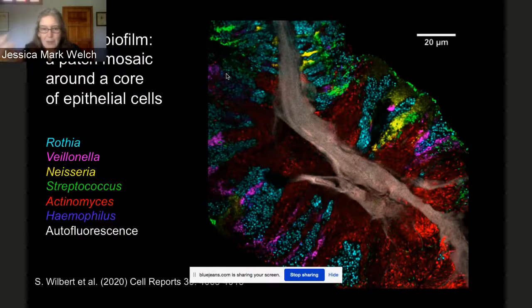I'm like, oh, great, we can take samples, right? So if you clean your tongue the way dentists tell you should, you scrape this sort of alarming quantity of material off your tongue. And then if we, again, fix it, drop it on a slide and apply probes, we see structures like this. And so in answer to the question, how often do you see a hedgehog? Yeah, a good fraction of the time, but not always.